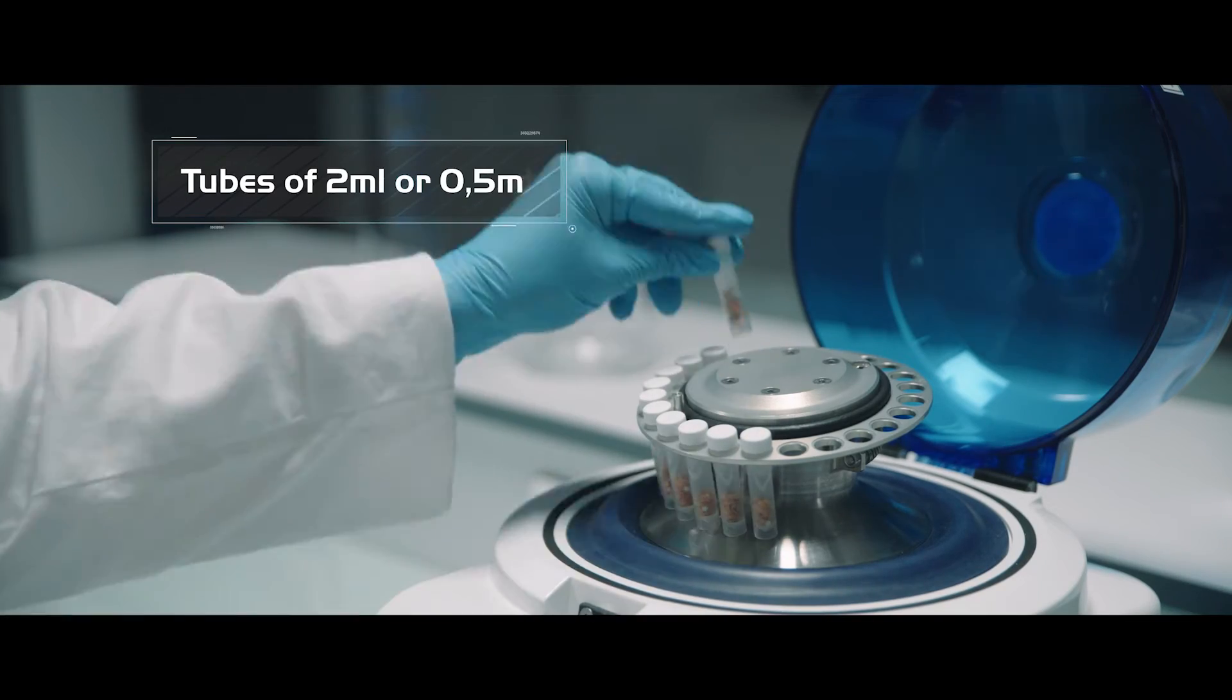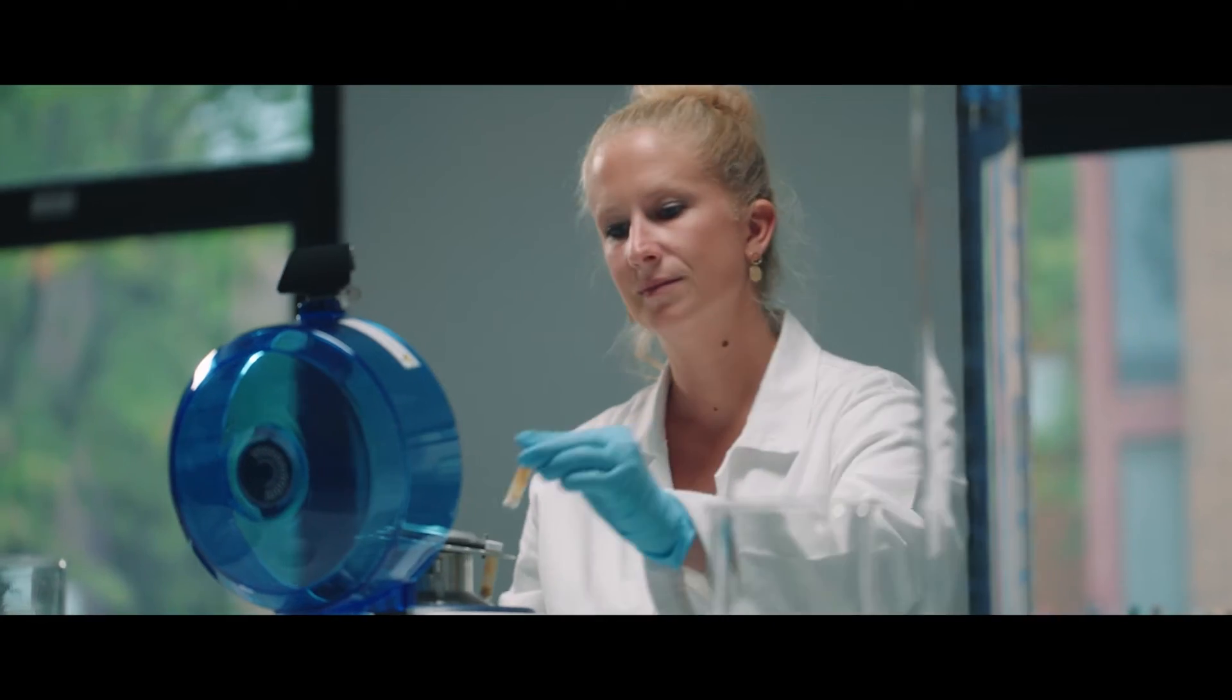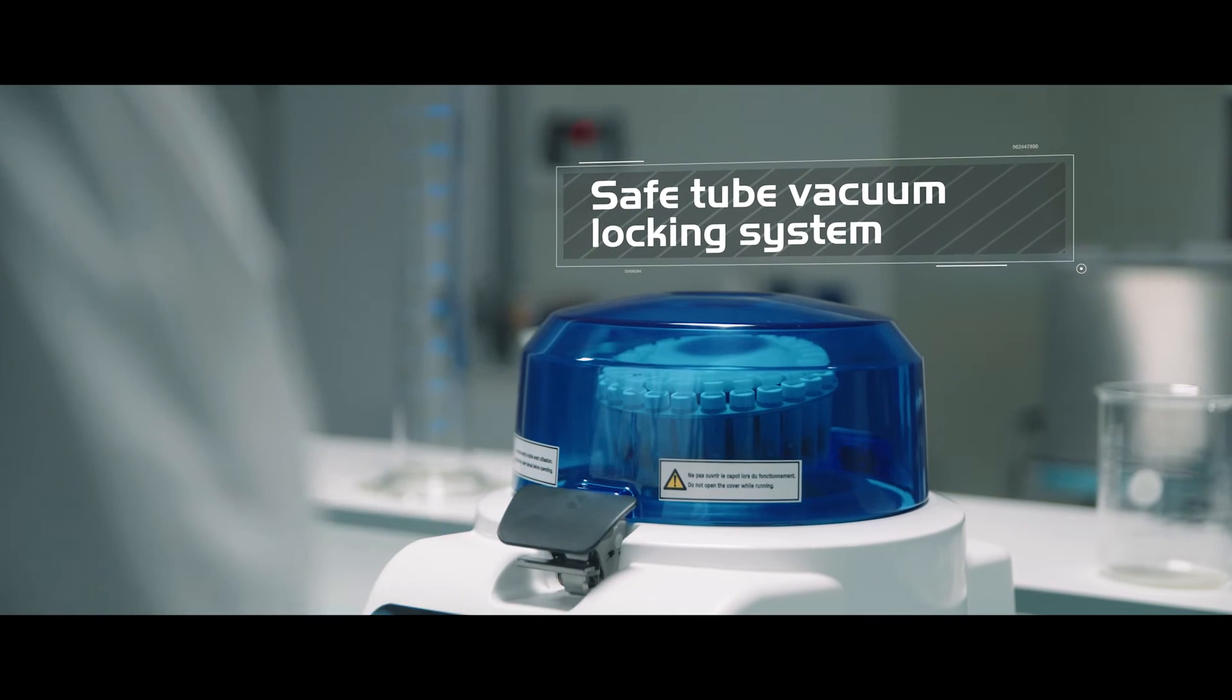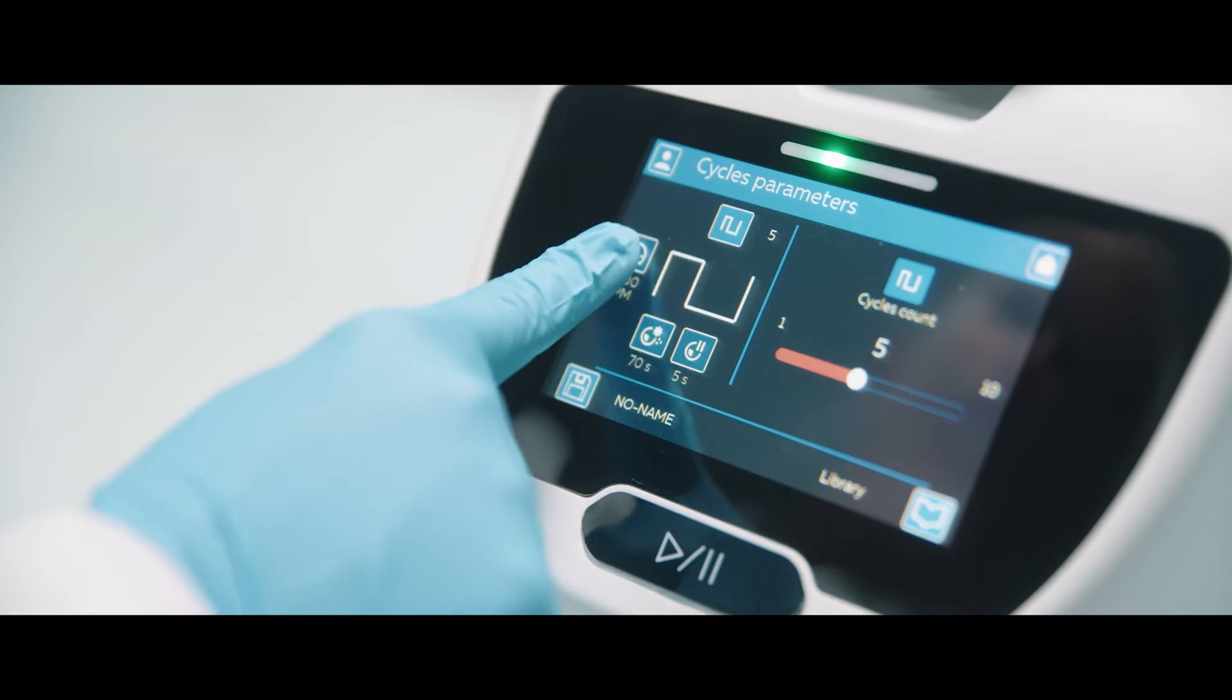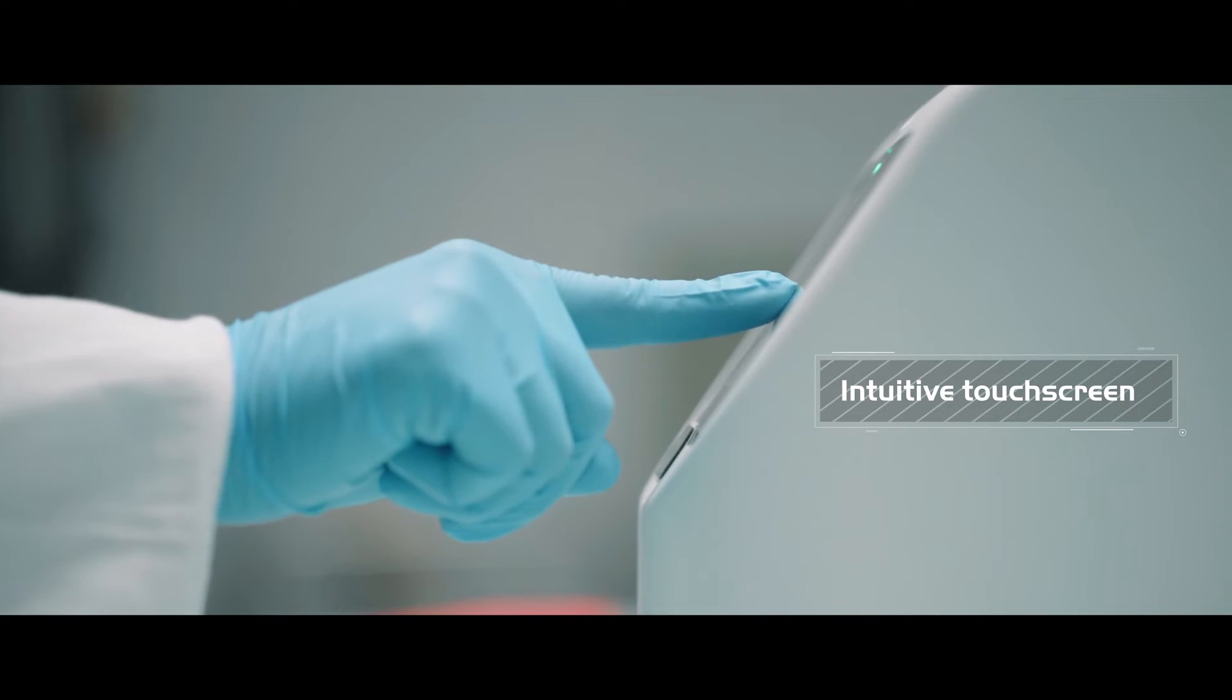Save time by processing up to 24 samples at once. Its touchscreen allows you to choose your protocol settings in only a few seconds.